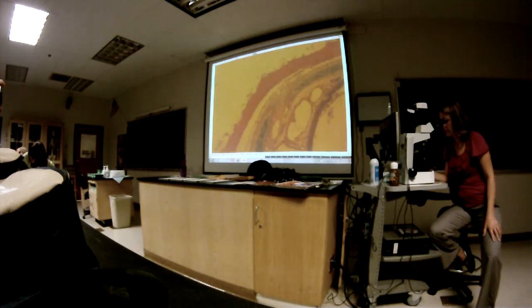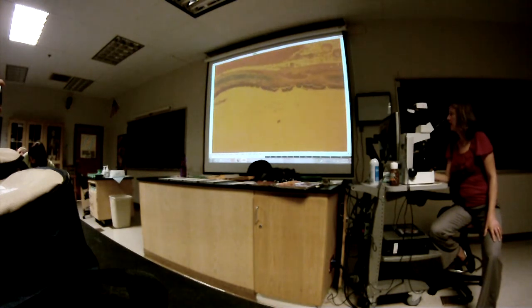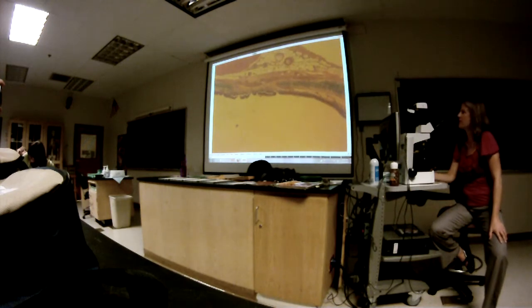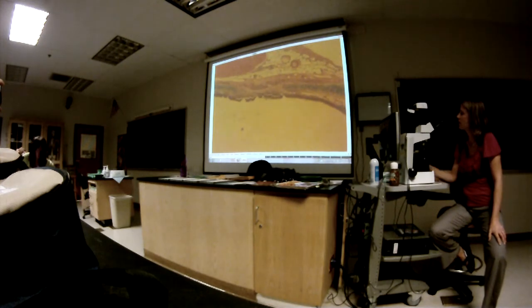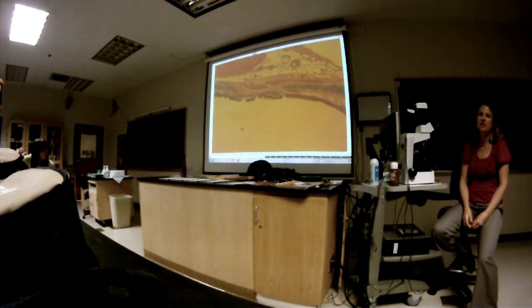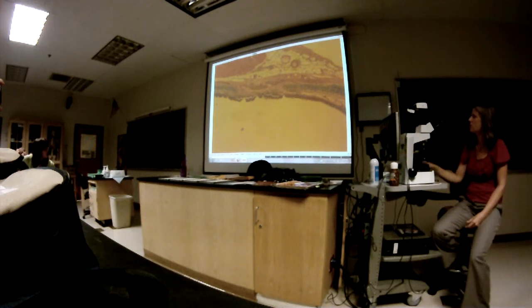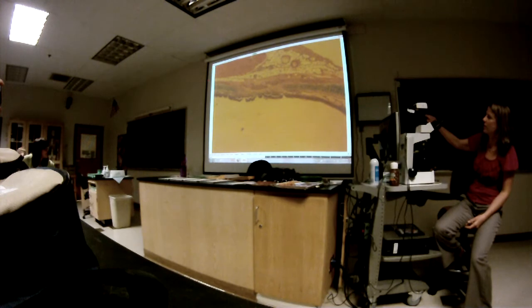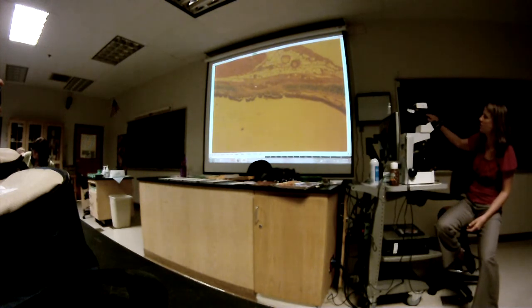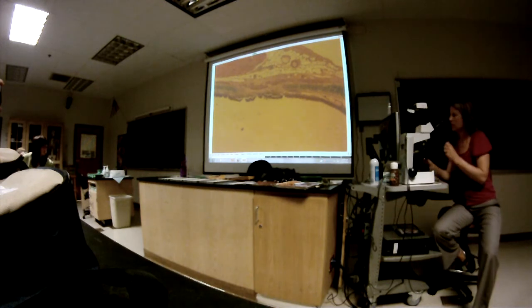And then if we go back here, I'm at the scanning lens, so I can't give you a bigger picture view than this. Back here, look for the smooth muscle up there. Usually in the gap of the C, you should be able to spot some smooth muscle. Here, a little bit over there. Usually it does go all the way across. They just may not have gotten quite the right section to show it all the way across. What's this smooth muscle called? Trachealis. That's the trachealis muscle. Good.